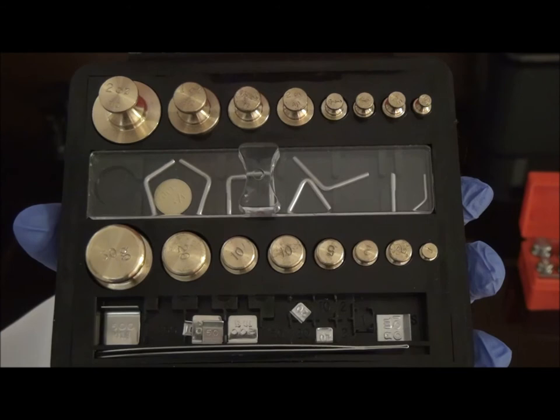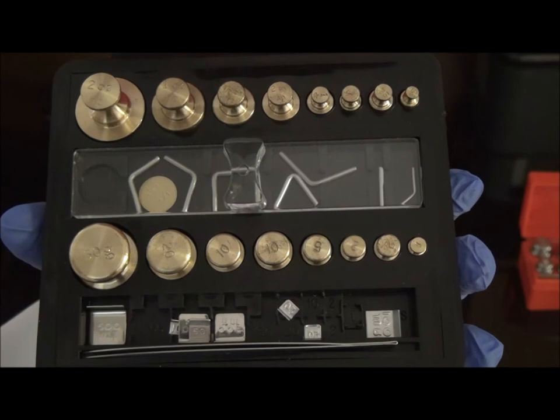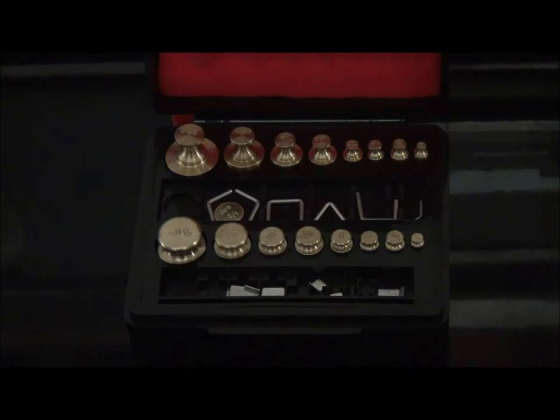Metric weights used exclusively for analytical purposes may come in a range of 1 mg to 100 g. This weight set comes in a range of 1 mg to 50 g. Weights that weigh more than 1 g are made of either finely lacquered brass, rhodium-plated bronze, or in our case, non-magnetic stainless steel.